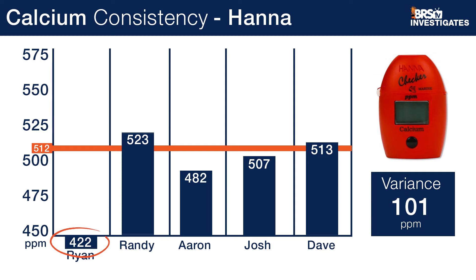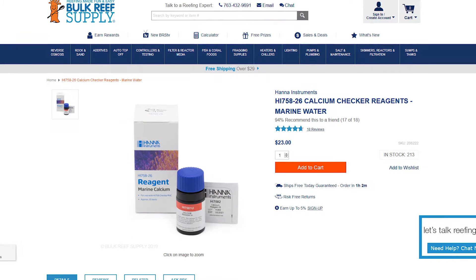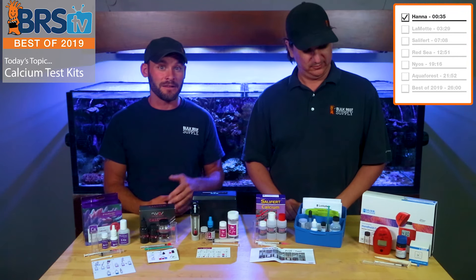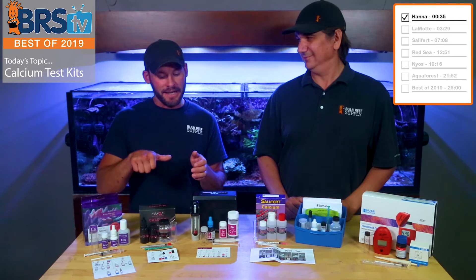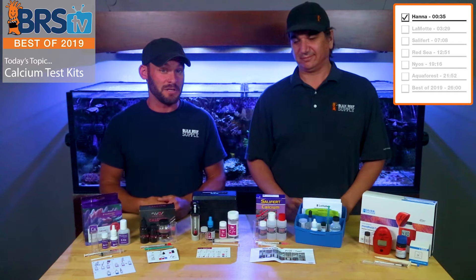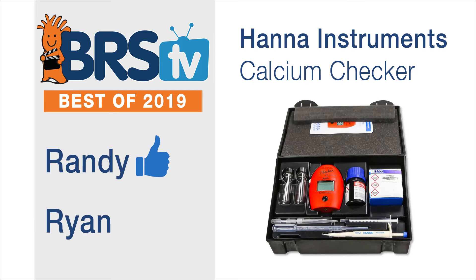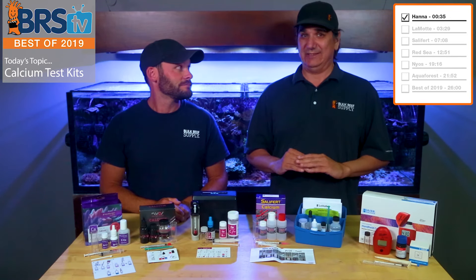For consistency, the low was 422 and the high was 523 out of all of us who tested it. Cost-wise, it's $49.95 for the first kit, and then they have reagents on top of that, making it about 92 cents a test. I want to give it a half thumb because it's just so difficult, and I like my calcium range to be more accurate than plus or minus 40 or 50. I'll give it one thumb. I love the Hanna Checker alkalinity checker, but this one is too much work and doesn't get me into a tight enough pocket to actually control. So I have to give it none.